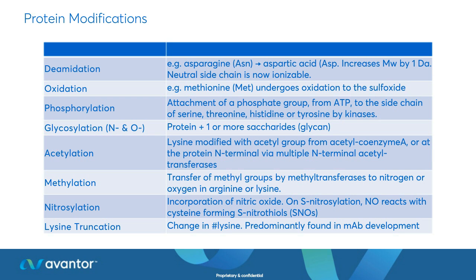But chromatography is so powerful, we can actually use it to separate that from the original protein that we were trying to make. And that's really why it's finding its feet for analysis, especially in the kind of QC or reaction monitoring of biological pharmaceuticals. So lots of different variations.